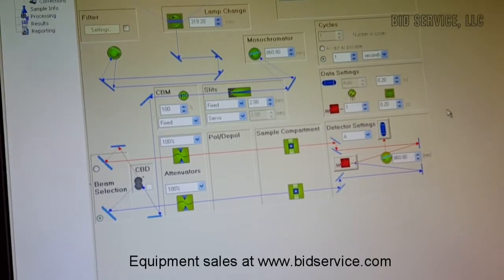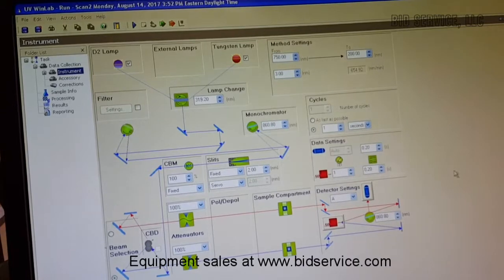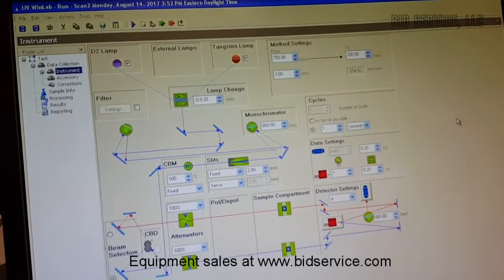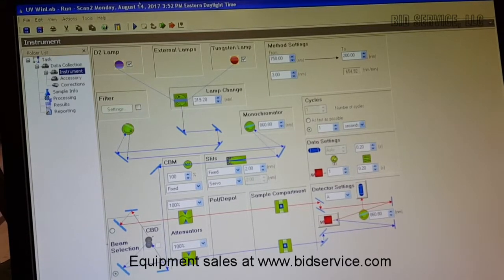So detailed instrument details are in the manuals. The manuals will be given either on a DVD or as hard copies.